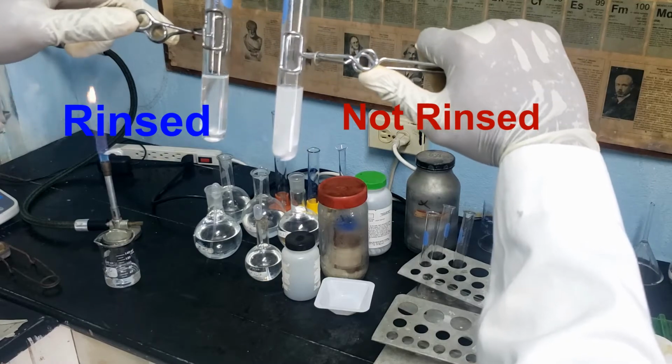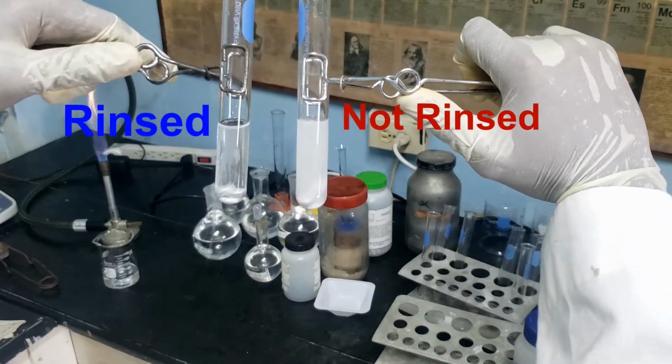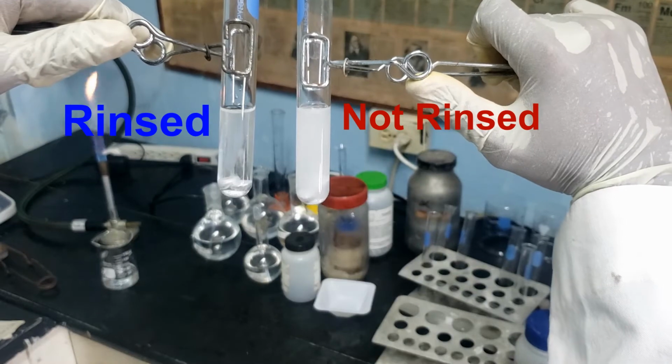The results when comparing the two tubes clearly show that the tube of aluminum that was rinsed is less reactive, producing less fizz than the tube that was not rinsed with water.